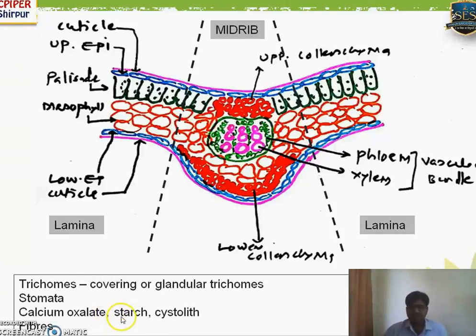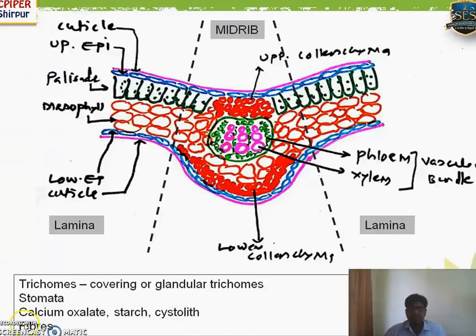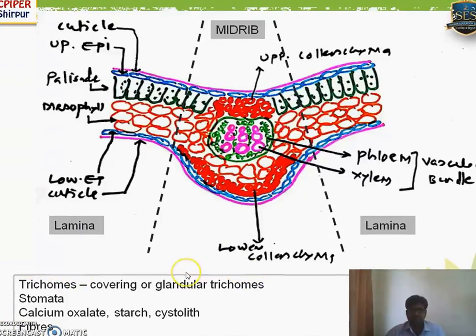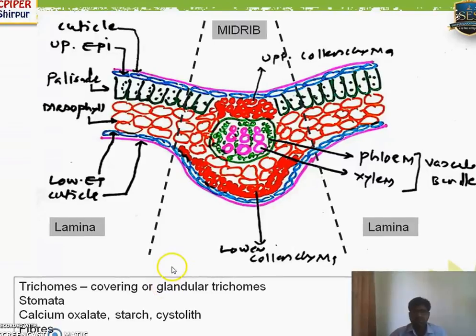Stomata, though simply showing an opening, have their own importance in surface preparation or powder characteristics for identification. Calcium oxalate crystals differ in size and shape. Cystoliths are cells showing the presence of calcium carbonate — that is again a distinguishing characteristic. Fibers, which may be pericyclic fibers or lignified fibers, may also be present. So in the general TS, different examples of plants differ by these various characteristics.